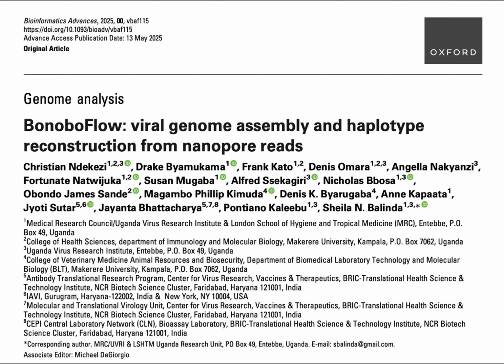Continuous improvement. Okay, so simulations are one thing. What about the ultimate test? Real-world samples. You mentioned they used HIV-1? Yes, they turned to HIV-1, a really important test case because it's known for its huge genetic diversity within patients and obviously its clinical significance. Right. They generated long-read sequencing data using the ONT MinION platform, specifically with the newer R10 flow cell and Q20 Plus kit, so expecting good quality data, from 24 archived HIV-1 plasma samples from Uganda.